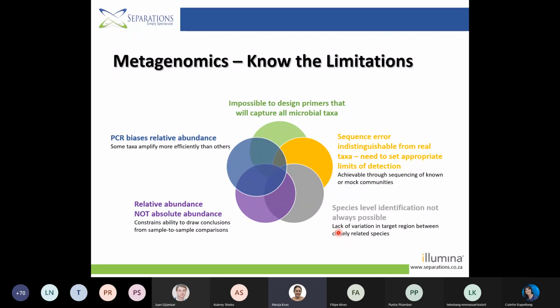When we're talking about a targeted approach, especially in metagenomics, right, when we are working with environmental samples, obviously there are limits to it, right? When we design that primer, it's specific, like I mentioned, for that group of organisms, either being bacteria, let's say protozoa or nematodes, or whatever that specific primer is looking at. Or, I'm digressing now, but if we are looking at, let's say, human health, and we are looking at the different genes that are associated with a certain trait, right? Then you can also have that specific primer designed to capture those, right? But because we are working with PCR, sorry, let's go back to metagenomics and environmental samples, we are talking about relative abundance, because that PCR is biased towards certain taxa, right?